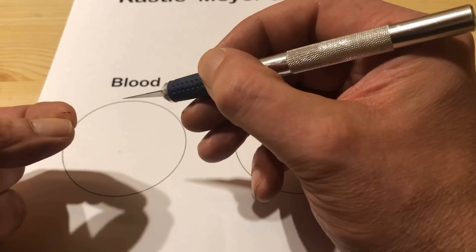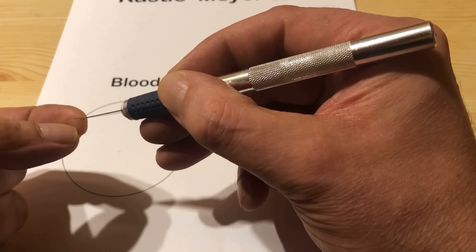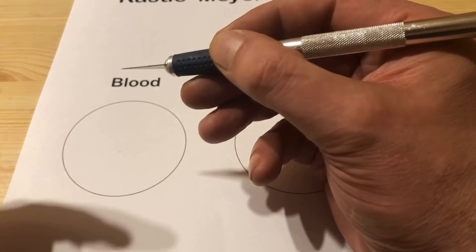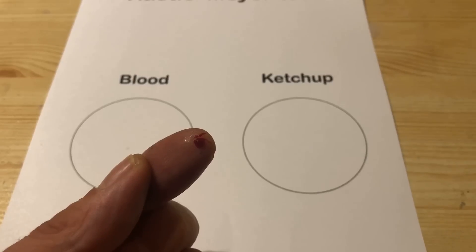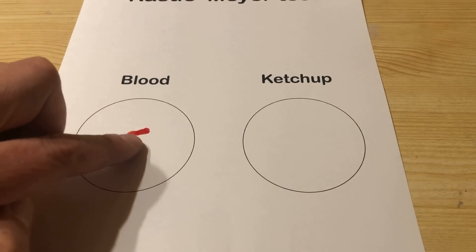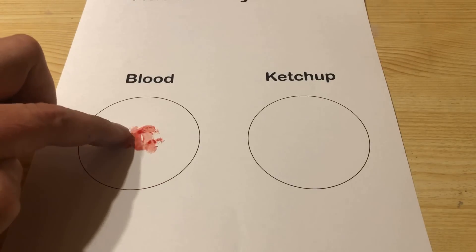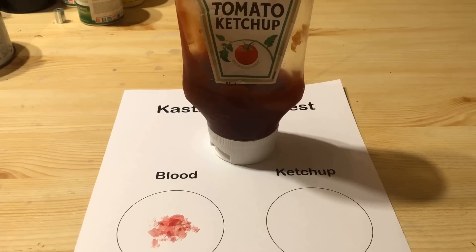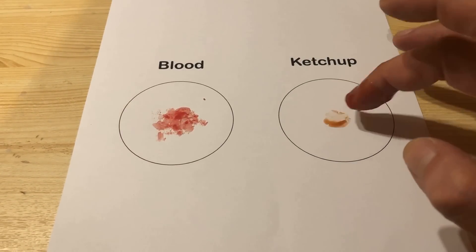Meanwhile, a blood sample and a blind sample are prepared. I simply slit my fingertip with a scalpel — it's now up to you to find a suitable blood sample. Ketchup is used as a blind sample. Chemistry is like cooking: just don't lick the spoon or your fingers.